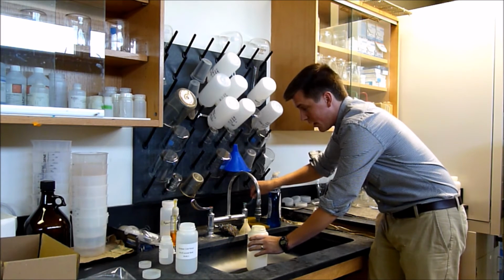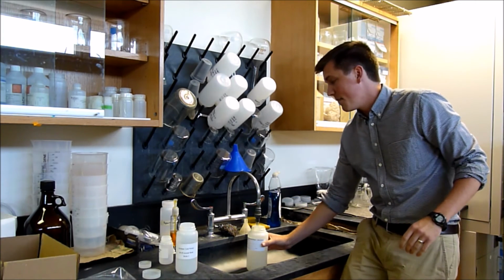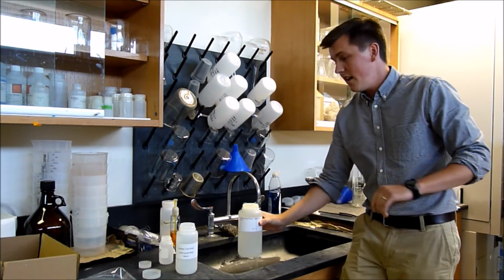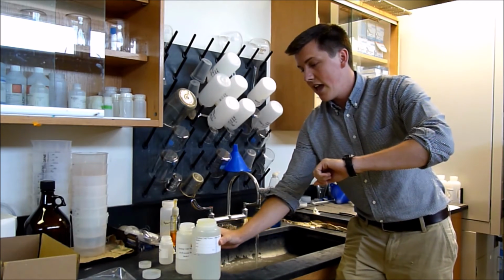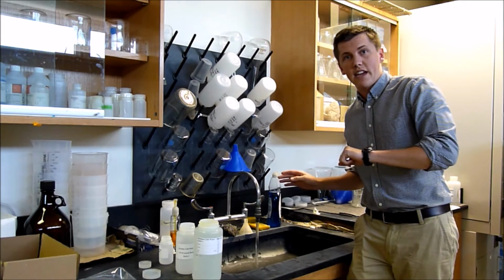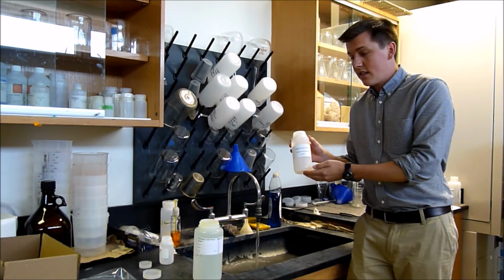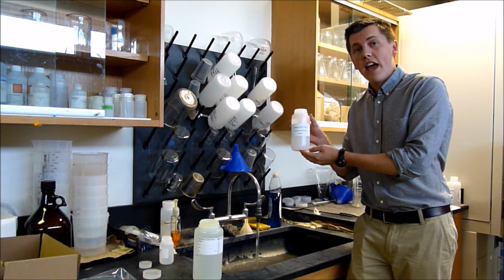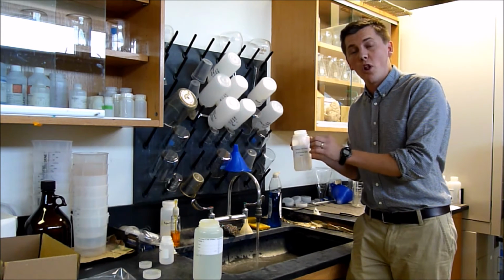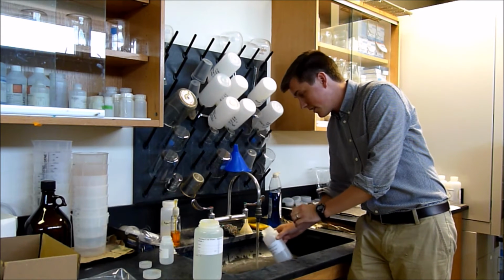I'll turn the tap on full bore and let that first liter fill up. When it's done, I'll take note of the time and set the bottle aside and let the tap run for 45 seconds. Now that it's been running for 45 seconds, I'll take the second bottle and fill it all the way up at the same flow rate, not altering the flow at all, by just sticking it underneath the faucet.